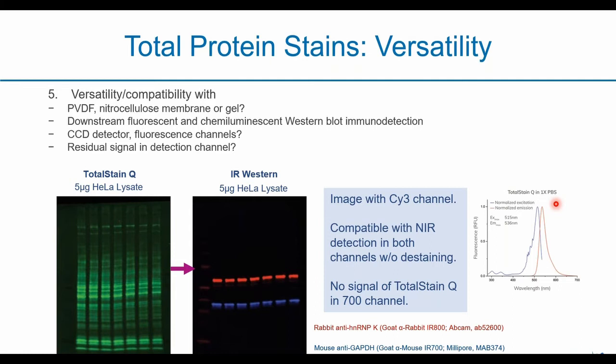Whatever signal you get is only influenced by energy input, which is from your excitation light source, and also the dye itself. The dye means how much your protein is tagged or labeled. So it's very simple. That's the reason that a lot of total protein stains use fluorescence. Okay, all right, so this is pretty much for fluorescence.